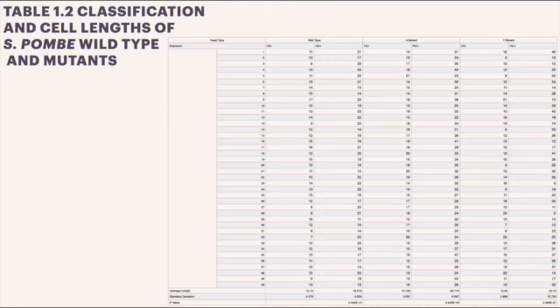For the wild type, the difference between the averages is 6.425, which will be the smaller out of the three sets of averages. And the p-value is a significant p-value. This p-value does reflect that the cell's G2 checkpoint is detecting DNA damage.